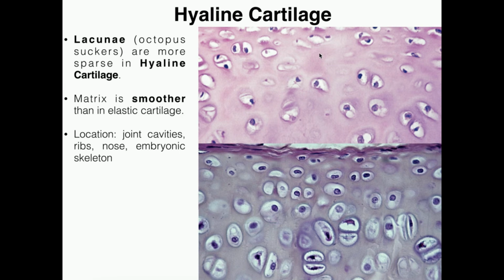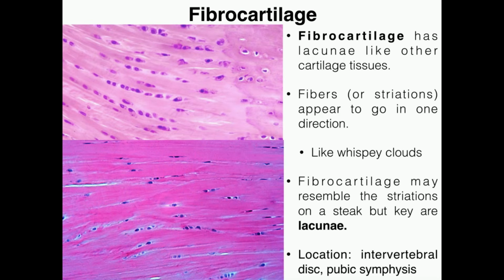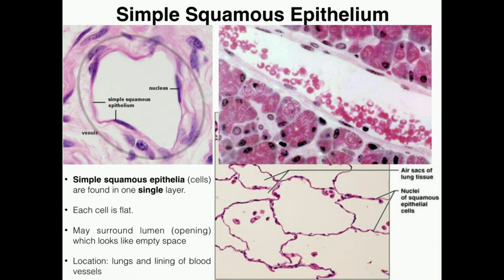Here the cartilage matrix looks kind of pinkish, but here it's very dark. Another example where it's typically observed is actually fibrocartilage. Here they're both kind of pinkish, but this one's much darker. But I remember when we looked at this in class, we had one where the matrix was blue. So don't memorize these based on the colors. Memorize these based on the features that each one of these has.